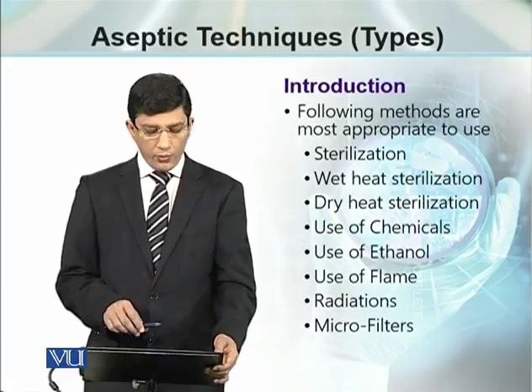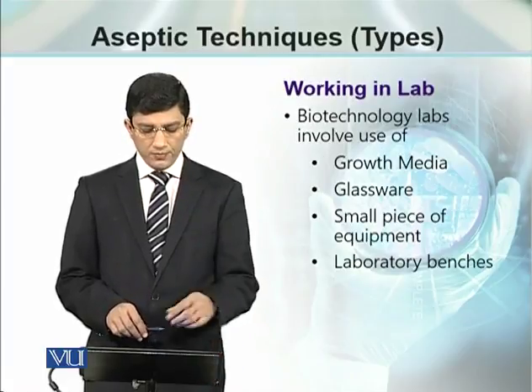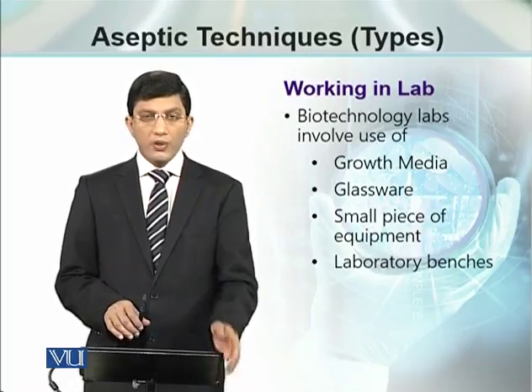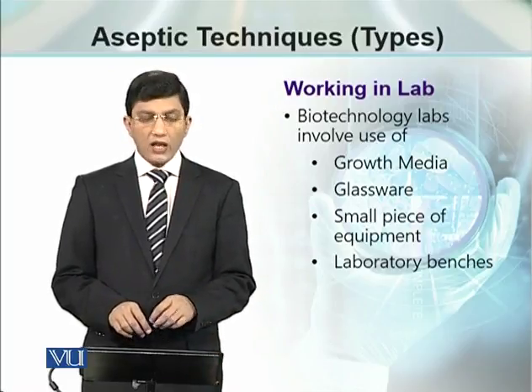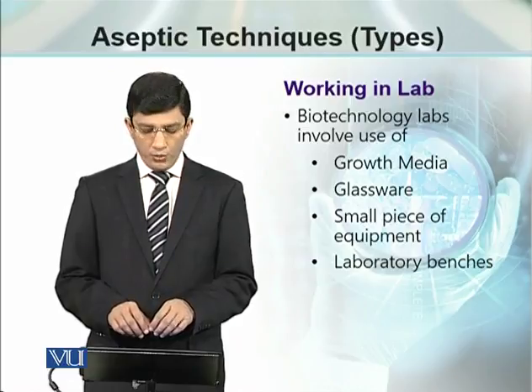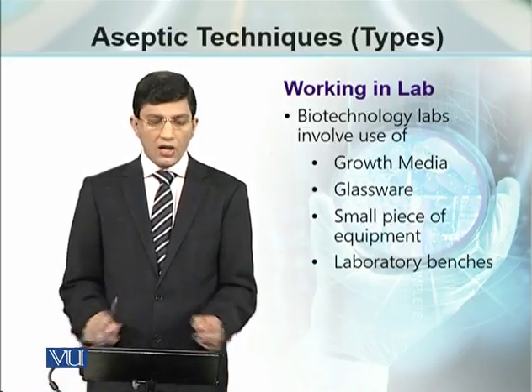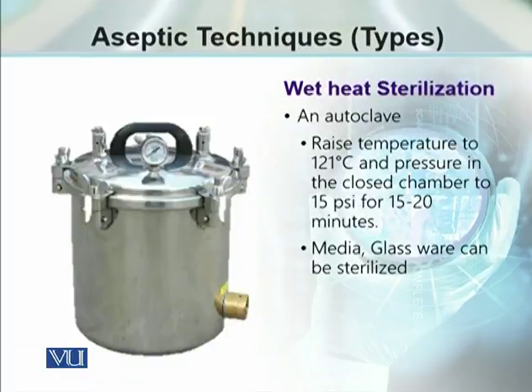In case of wet heat sterilization, within the lab, we come across growth media, glassware, small pieces of equipment or laboratory benches. While working in the lab, wet heat sterilization is the most common method to sterilize small pieces of equipment as well as media, the culture media.